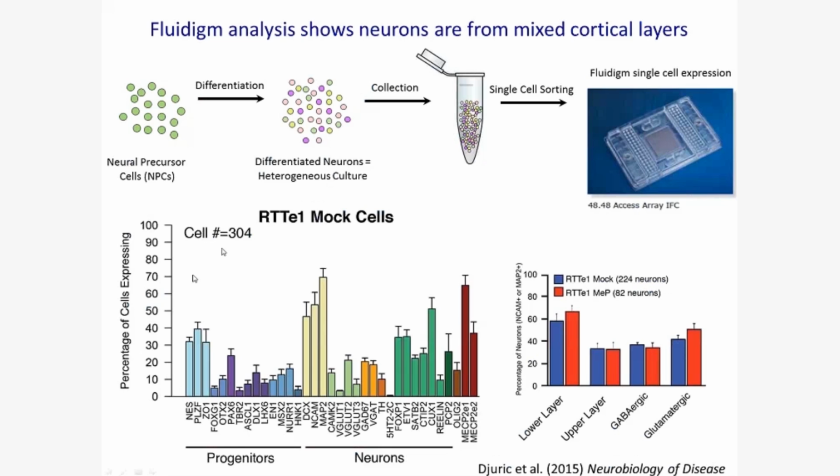And when we compile all these data, here what you can see are the number of cells that were analyzed that expressed a specific marker. We can look at the expression of certain markers of both neural progenitors and neurons, including a number of different neurotransmitter phenotypes. And all of these primer sets and this approach is described in a study from Ricardo Dolmetsch's lab that is referred to in the final slide.